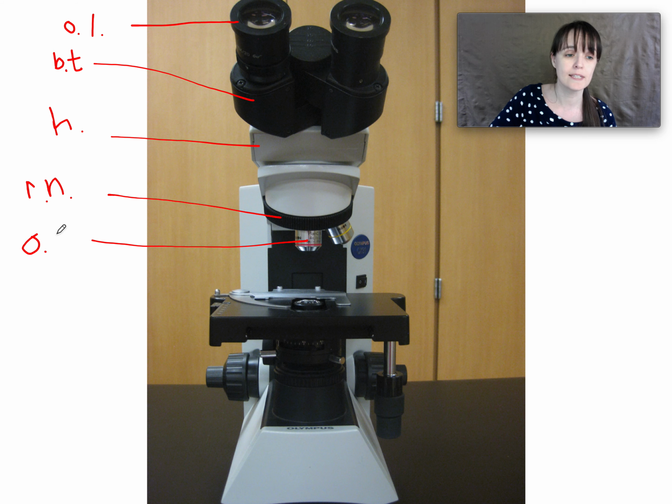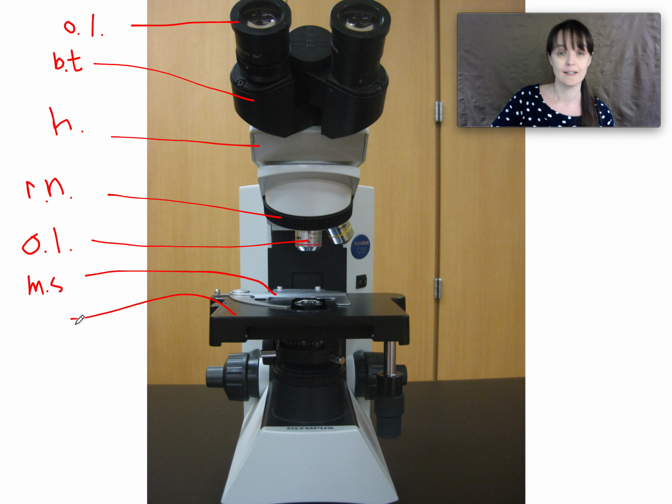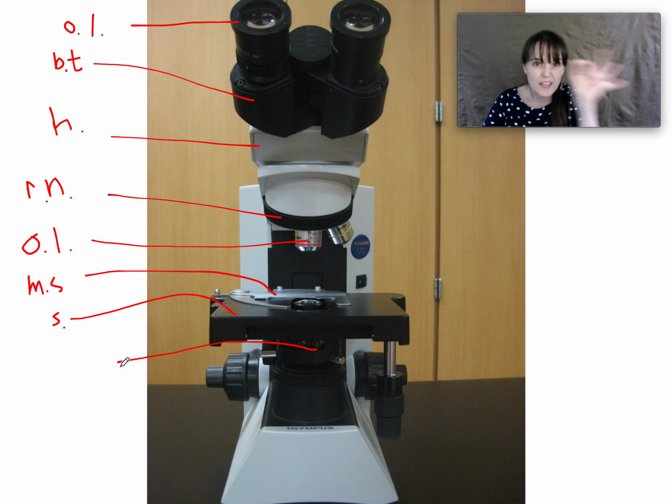Now here on the lab test, they are never going to ask you which objective lens. The red low-powered objective lens is not the right answer here. Objective lens is what you need, regardless of which objective lens it is. Silver bit, mechanical stage, and then that tiny, there's a little plastic lever that moves back and forth there.